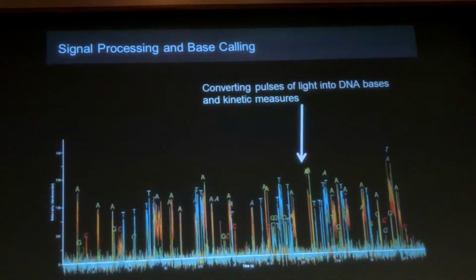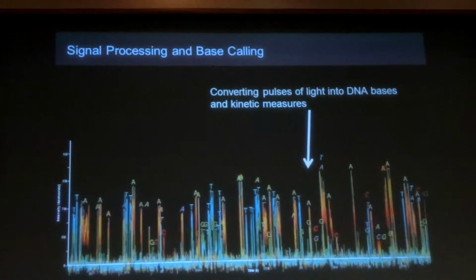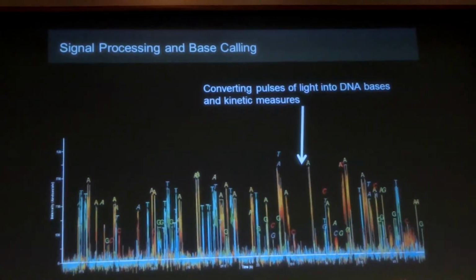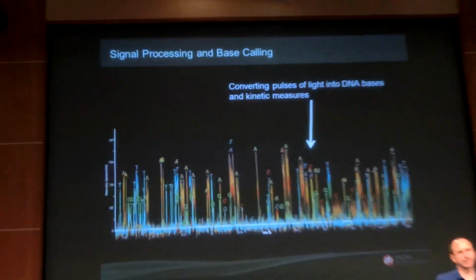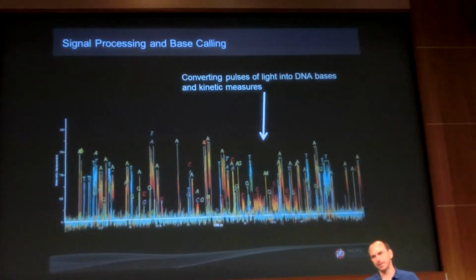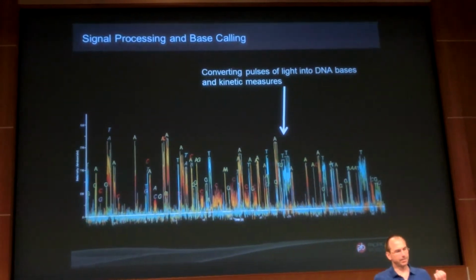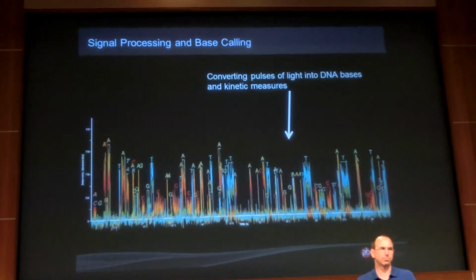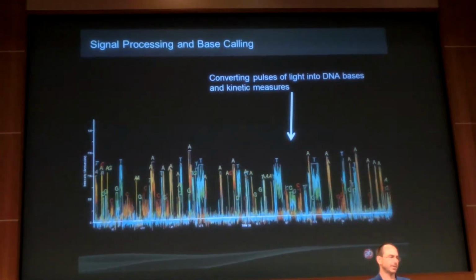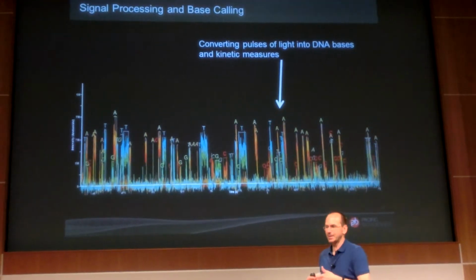The key here is we create a trace file, and ultimately there's a three-step process, and I'll talk you through what we call our pipeline. What you're getting is pulses from these nucleotides as they're getting incorporated. Those go through a camera, and then those are creating images, but that's happening across, in our case, 4 different wavelengths, 4 different cameras, so we have to reassemble all that, put it all back together, and that's where we just get the pulses.